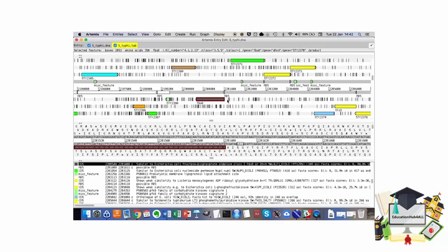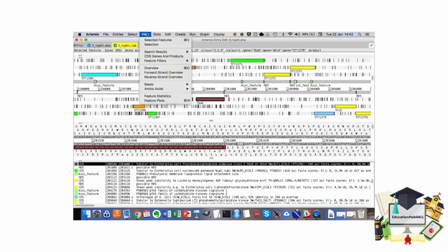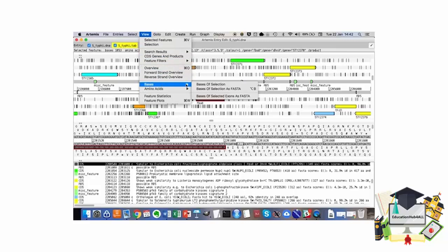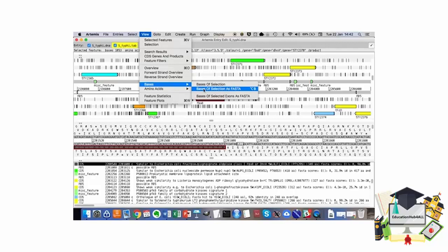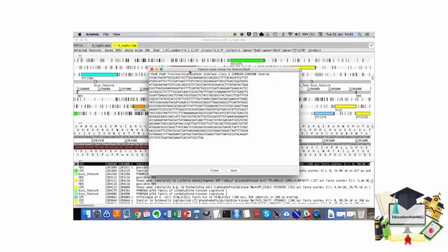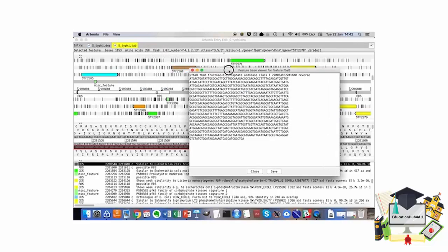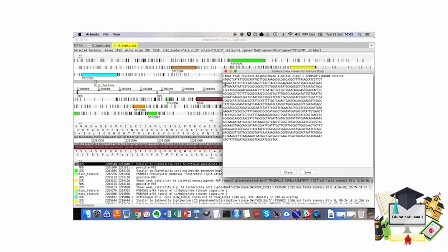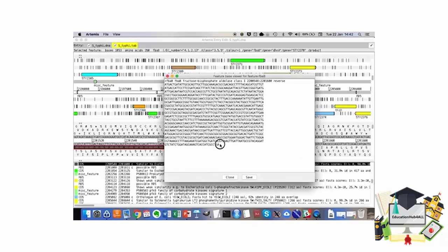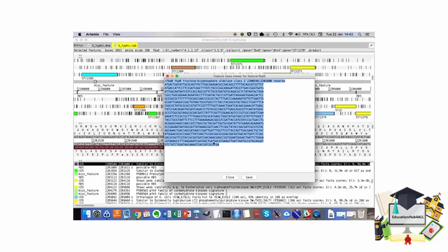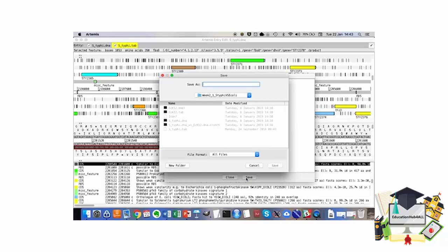The next thing we're going to learn is to visualize the nucleotide and amino acid sequence of this gene in a separate window. To do that, I can go to View, Bases, Bases of Selection, and in this case I want to see them as FASTA. If I click here, these are the nucleotides that are composed in the FBAB gene. From this window, we can copy and paste by highlighting and then put it in another file if we want, or in a BLAST search if need be. Notice that you can save this to a file. I'm not going to do that right now.